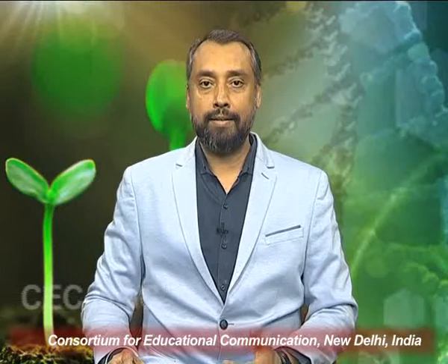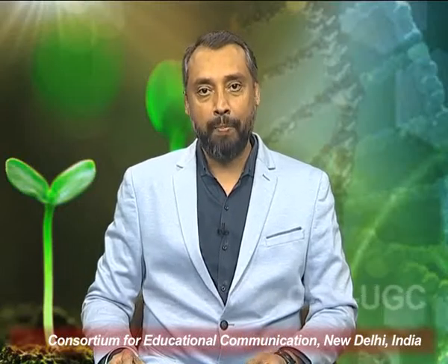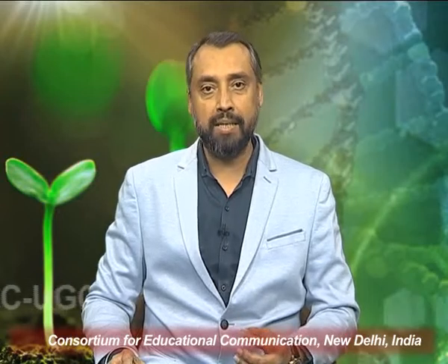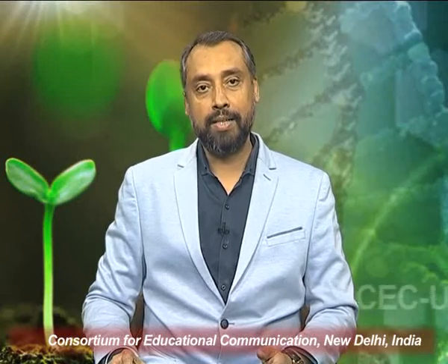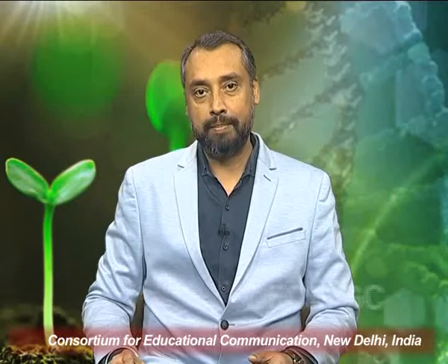Today our topic of lecture is going to be a very interesting one. We are going to learn something very fundamental and very basic whenever we want to work in a laboratory environment. Today we are going to discuss the basic laboratory instruments.